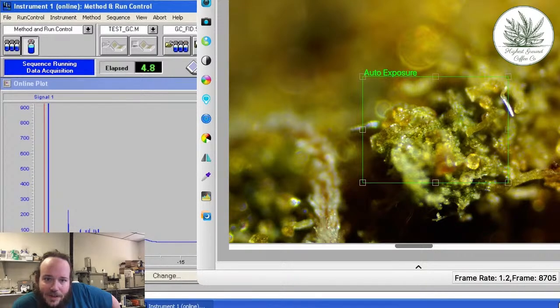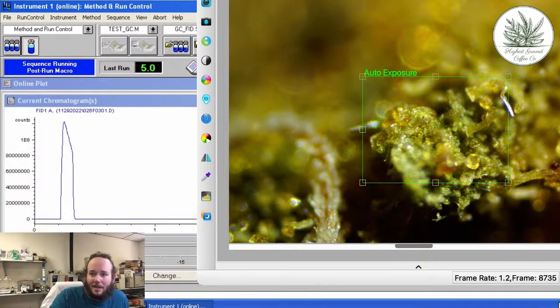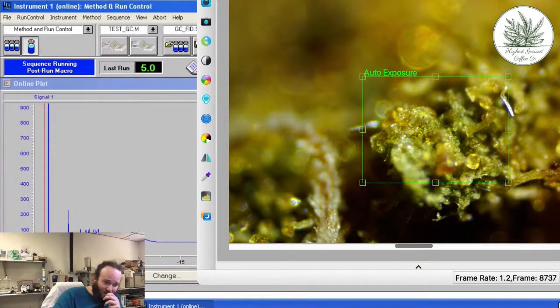Yeah, that's so bizarre. They're identical again. They can't be identical. It's not possible at this point. All right, well, we'll see what the 10X does, since that one used the 10 microliter pipette. Well, nothing to do but wait and see there.